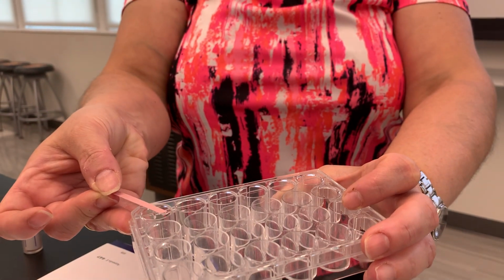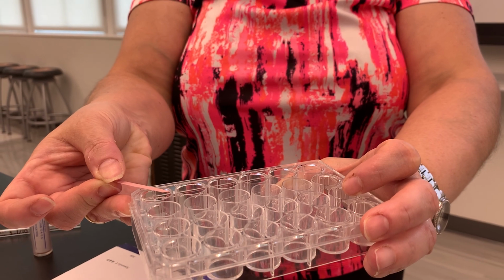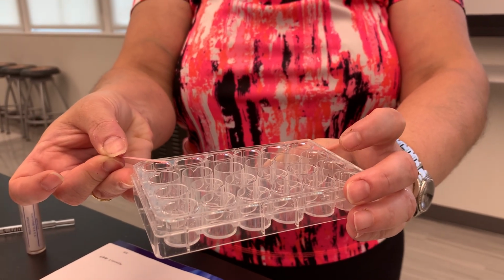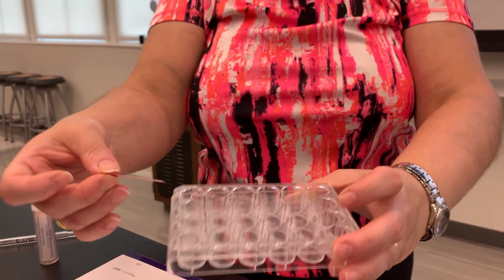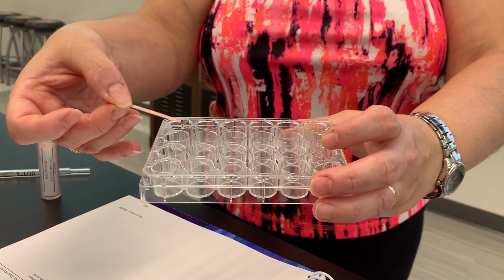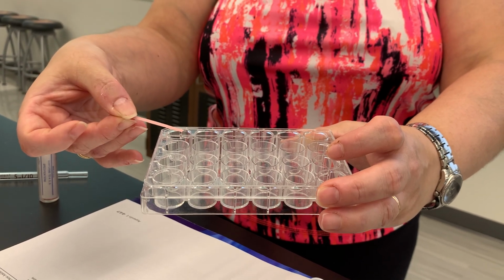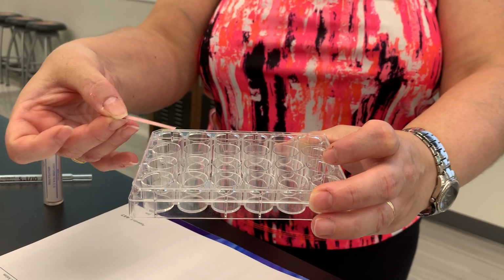Instead, you want to hold it like this, flush with the well, hoping that the vapors of ammonia produced in the reaction will penetrate the paper and turn it blue. Now, one possible difficulty you might experience is that, as you can see, wells are really close by. And so sometimes you're testing, and ammonia may have formed in the neighboring well, and you're testing the next one over, and you're still getting a false positive because ammonia vapor sort of drifts over here.